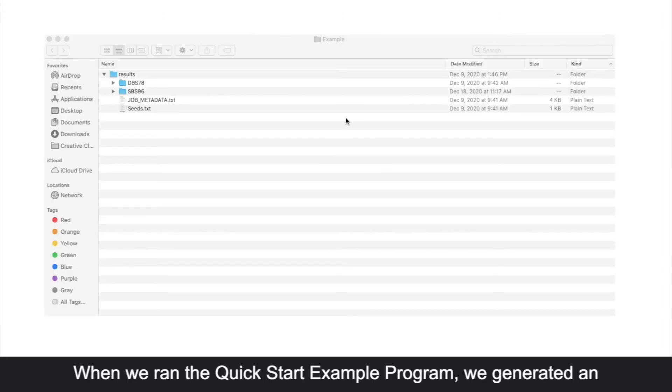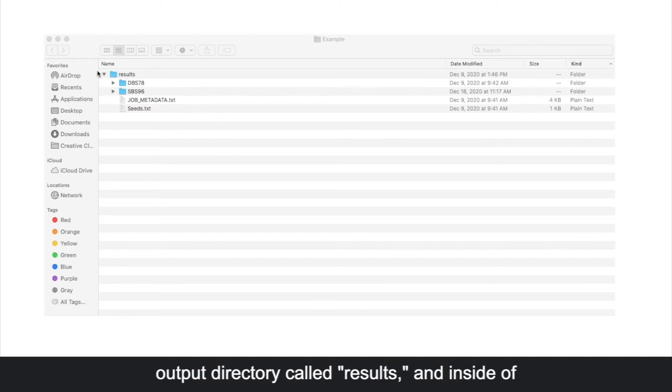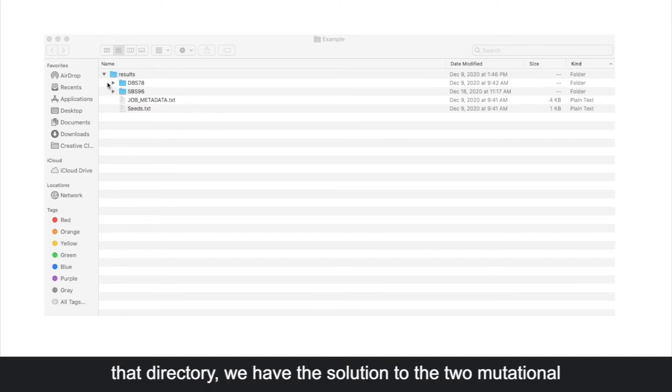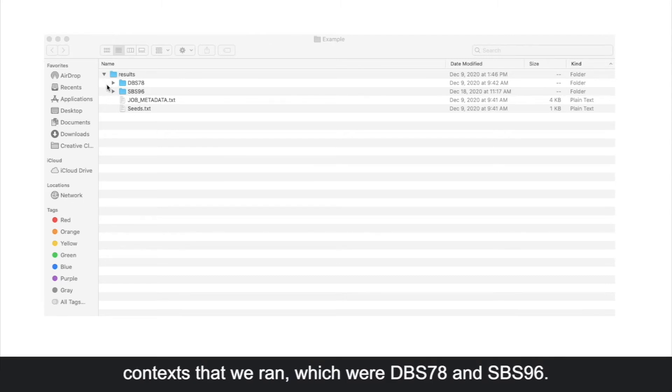When we ran the QuickStart Example program, we generated an output directory called results, and inside of that directory, we have the solution to the two mutational contexts that we ran, which were dbs78 and sbs96.